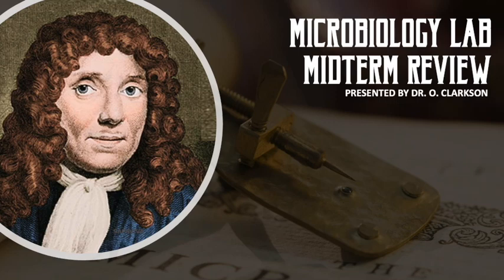So let's go ahead and go through the midterm from start to finish, and we'll cover everything that you guys need to know. Now, for the very first lab we did the ubiquity lab. In the ubiquity lab, you took samples of different things: door handles, clothing, maybe your shoe. If something's a non-living thing that can harbor or carry a pathogen, what is the term for that?